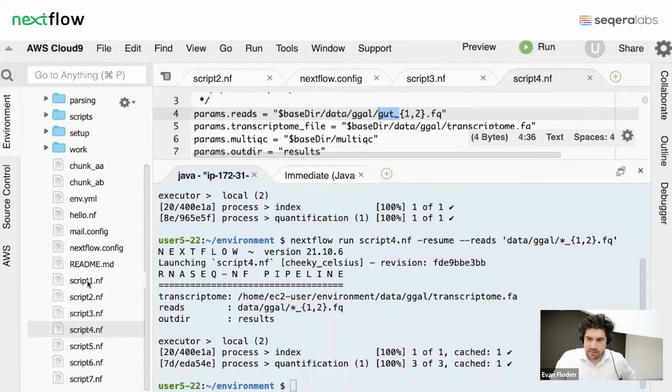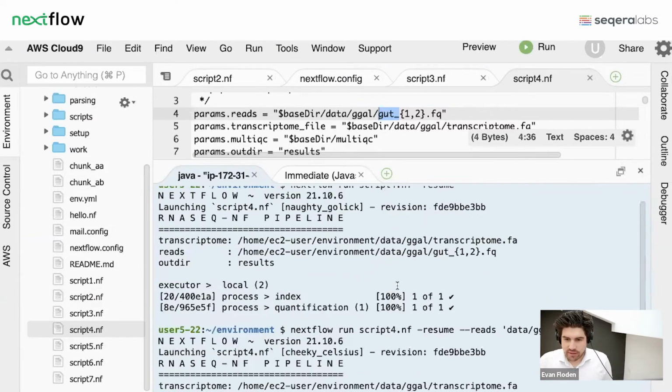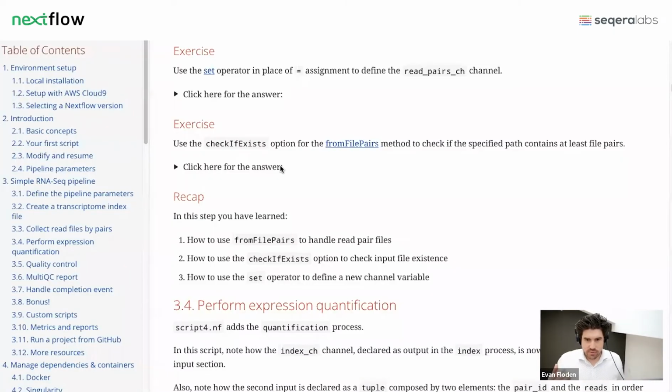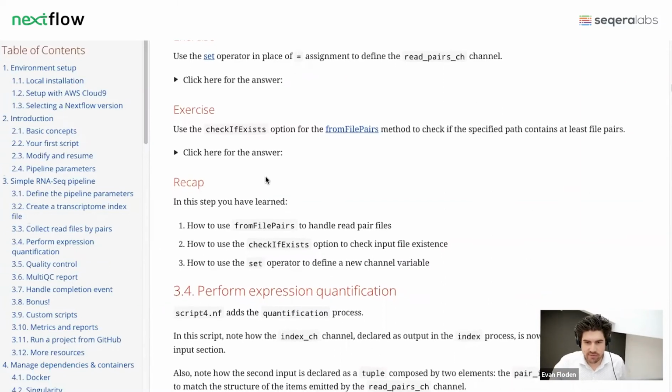So this is a game where you can build your pipelines up step by step, and as you add more steps or as you add more data, you've got this caching mechanism as well. That's going to link you in there. The next exercise I want you to do is now we're going to introduce directives a little bit more formally than we saw before. These directives are ways that you can modify or decorate or label processes themselves when they come.